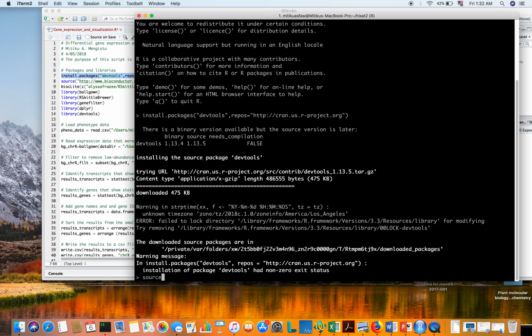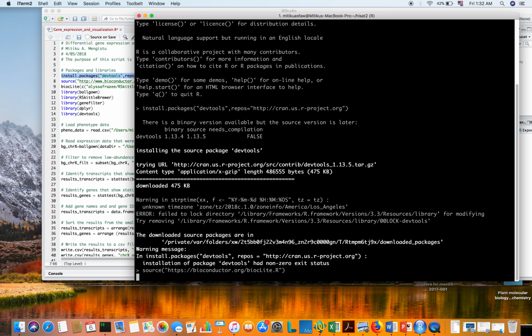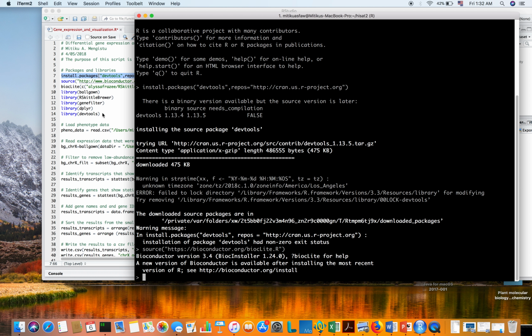So then I need to call the Bioconductor, bioconductor.org slash bioclite.R. Okay.